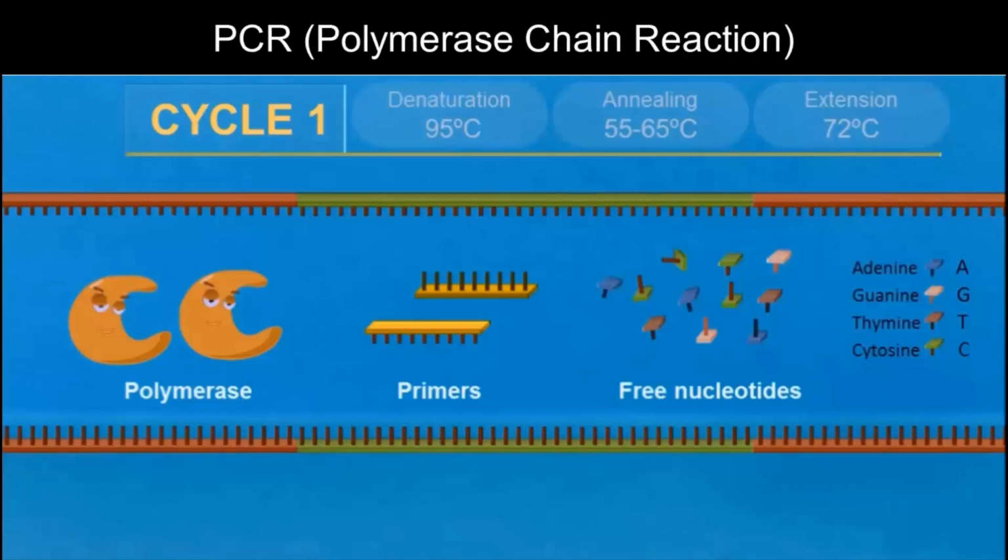PCR, or polymerase chain reaction, is an excellent tool for this. PCR mimics the steps of normal DNA replication, but it replaces the need for most of the replication enzymes using temperature fluctuations and small pieces of single-stranded DNA called primers. This is a technique better illustrated with animation, so I've put a video about PCR on the lessons page that has some nice art design.